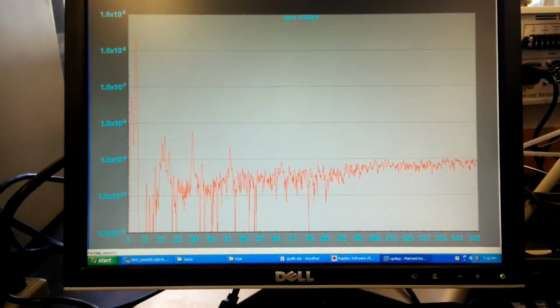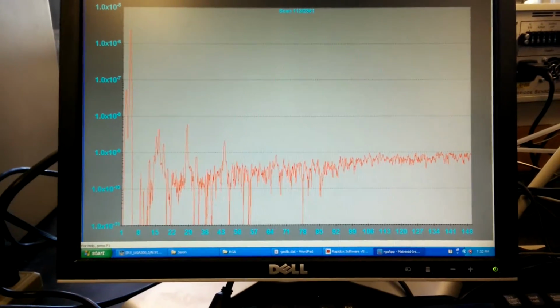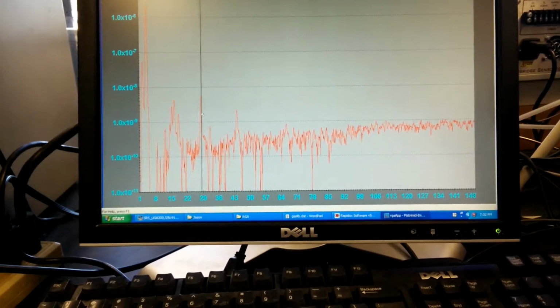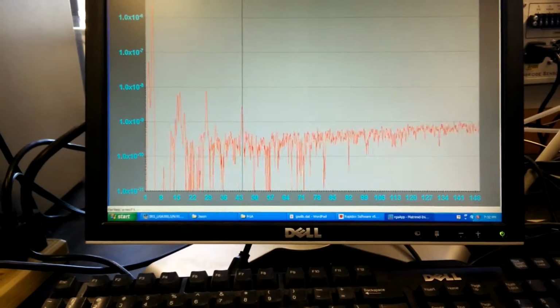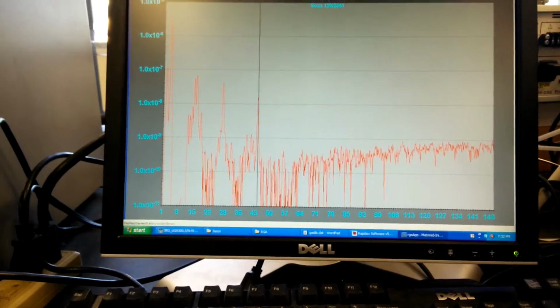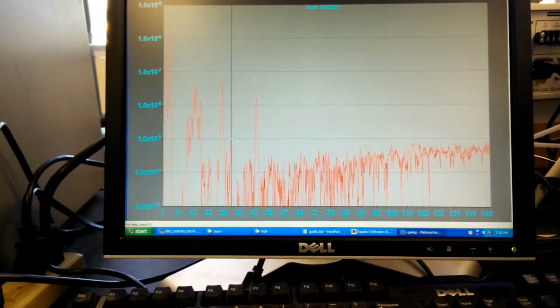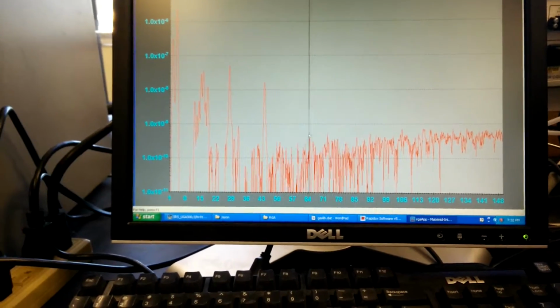As we get close to the decomposition temperature around 450 degrees Celsius, we start seeing many gases coming off, specifically methane and water and some carbon monoxide and carbon dioxide. These peaks start growing quite dramatically right now. We also see some other peaks that form in this range over here, but I'm not sure whether they are physically significant.